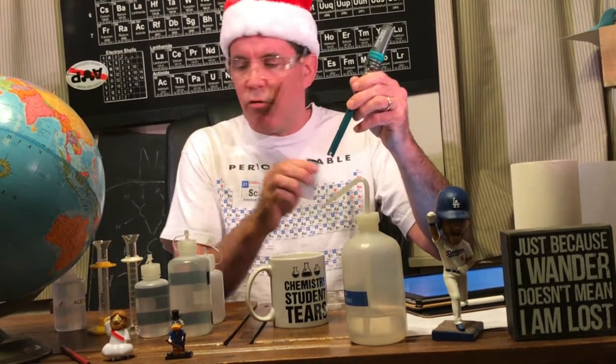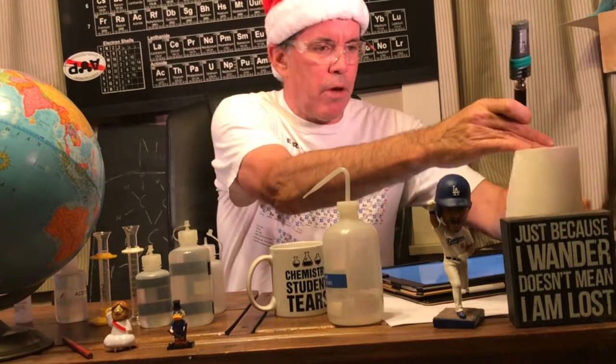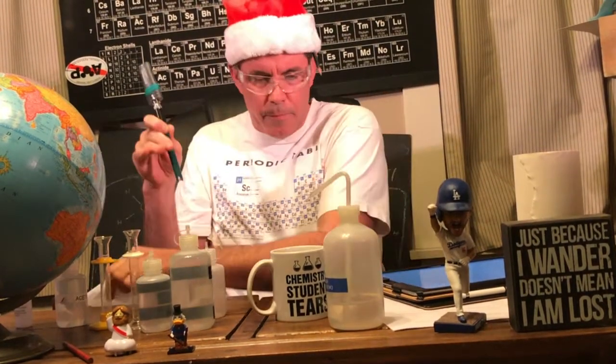I'm going to use this Vernier pH pen. It is stored in a solution that keeps the glass bulb moist. They're quite amazing devices. They can measure very sensitive amounts of ions.